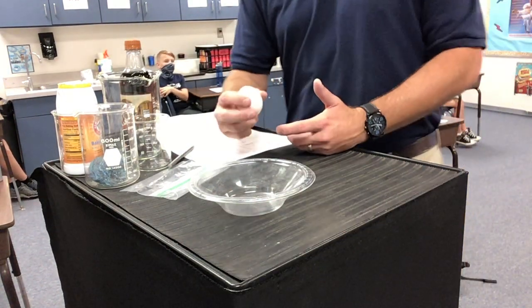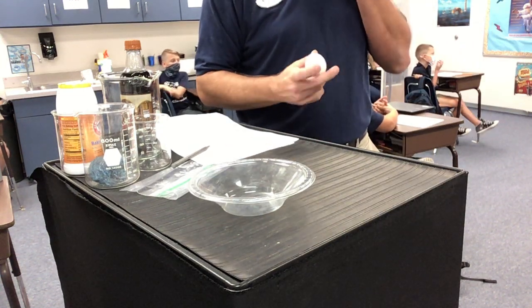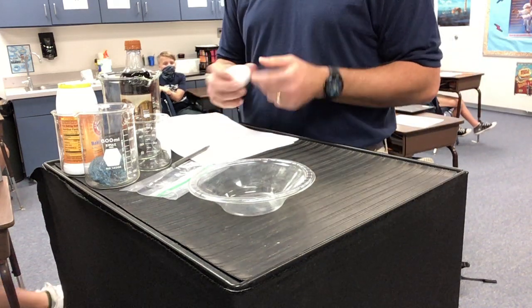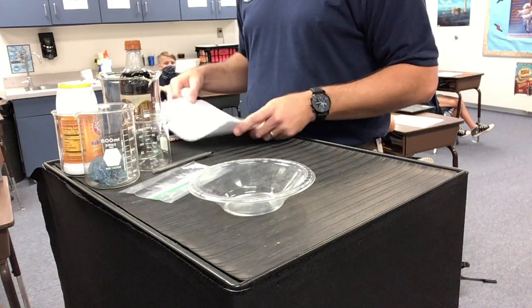Okay, so we are going to be talking about different chemical and physical changes today, and you're going to see some examples of these. And you've got to tell me what evidence, if any, proves that it's a chemical change. And if there's nothing there, you know it's a physical change. So we're going to go through this little lab, and we're going to use this as like a checklist, okay?